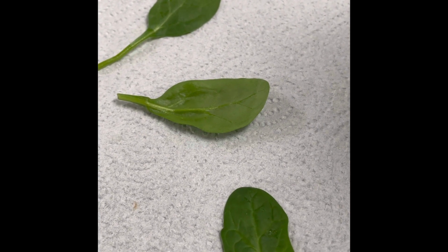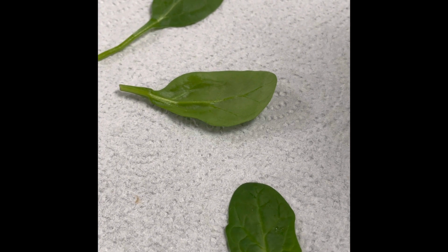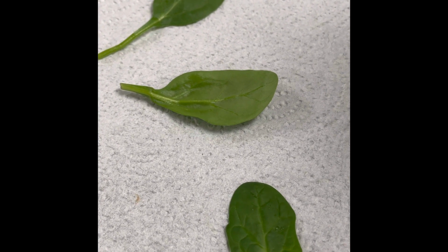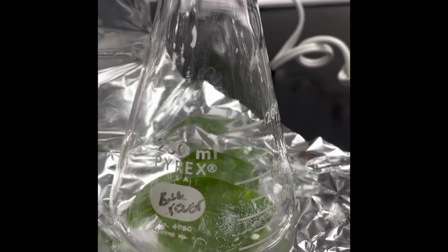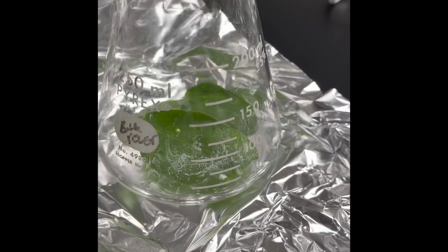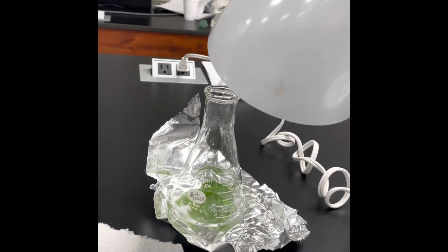All right, so here is the setup. I bought some spinach leaves, just took them out of the bag. They should be fairly fresh from the store. I put 2 or 3 leaves into this flask. Notice I've got it surrounded by foil. And here's my light source that I'm going to be shining on it.